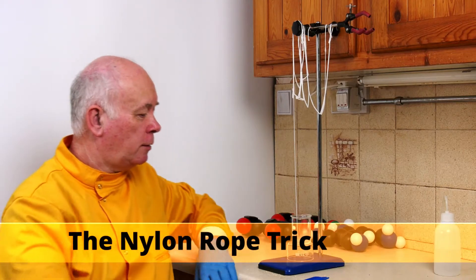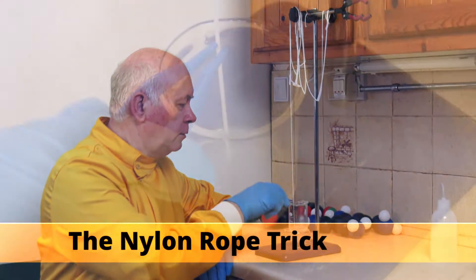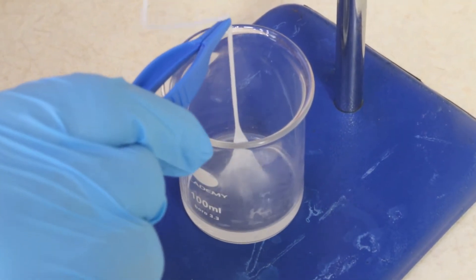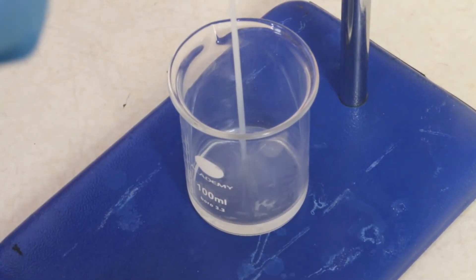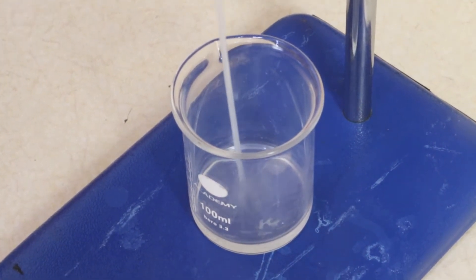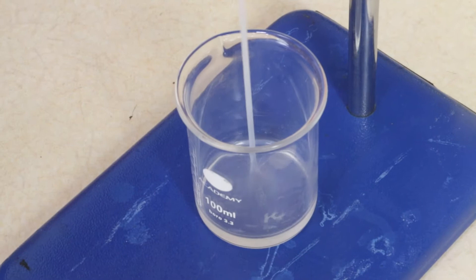This is the nylon rope trick. We've got two chemicals and when we grab hold of them, then magically they form nylon. Let's have a look and see how it works.